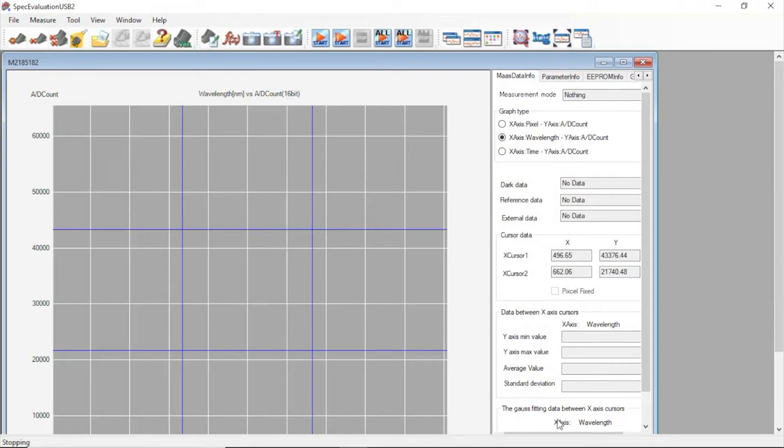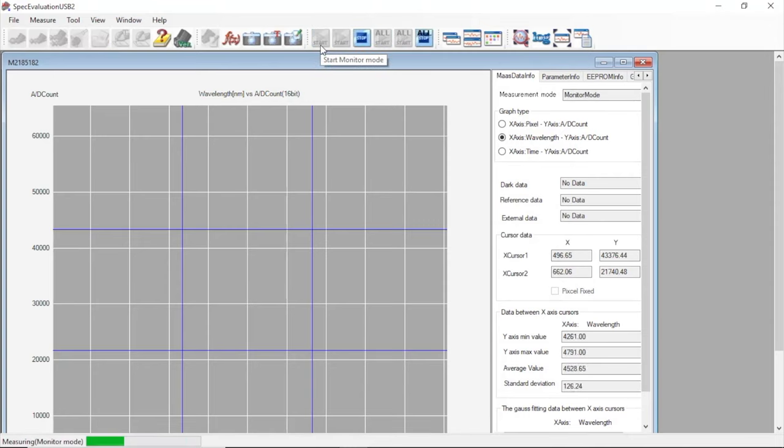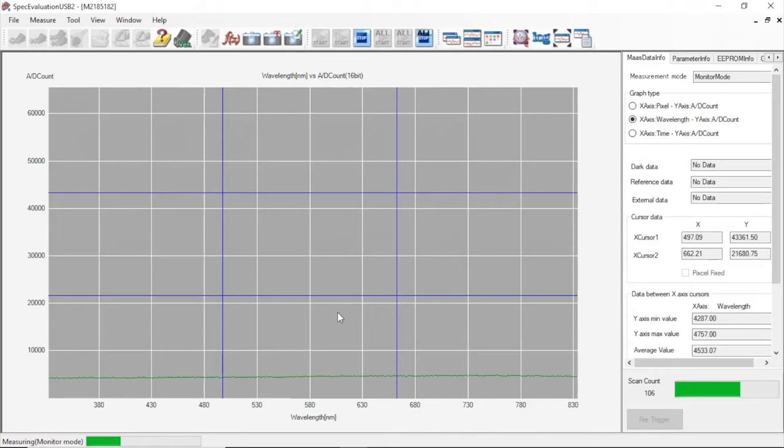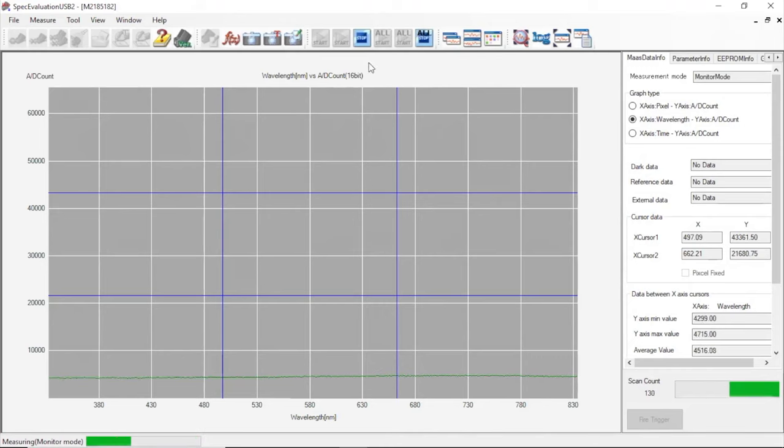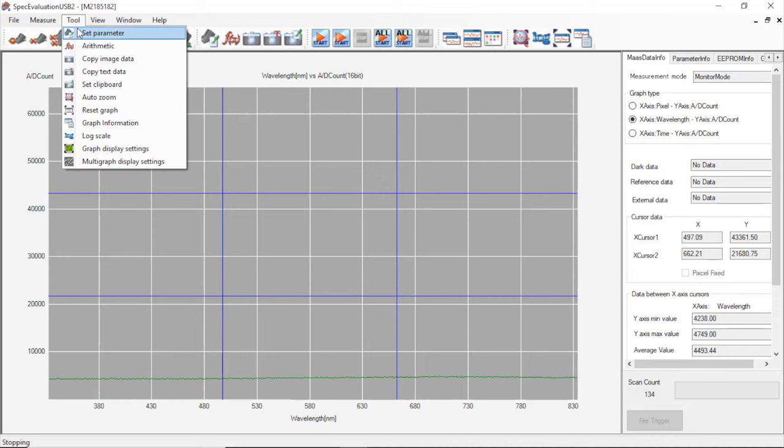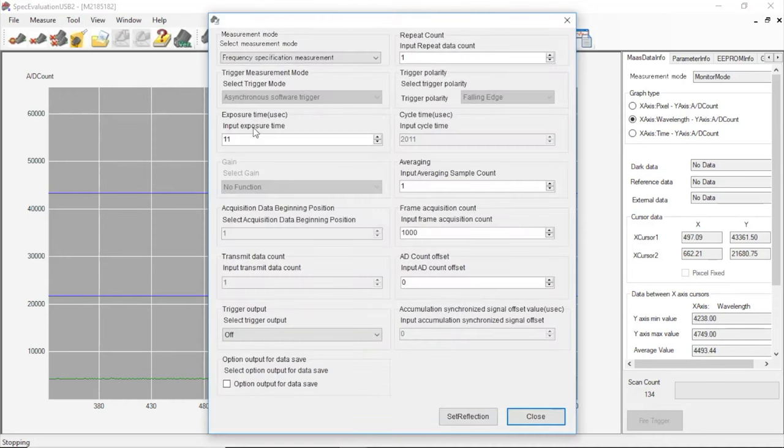So with our integration time set, we'll check what output we're getting using these settings. After closing the tab, we'll open the shutter on our light source and we'll select this button to start monitoring output. Keep in mind that the data that's shown here will not be saved, it's simply for display purposes. If we look at our plot, we see we have an A to D count of about 3000.